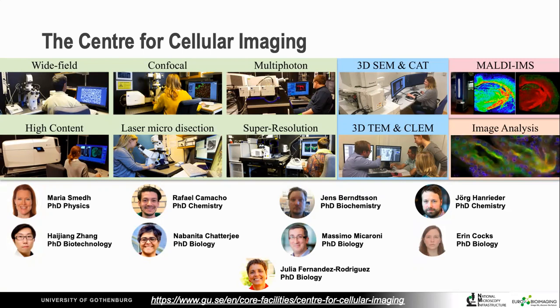And then depending on how we prepare the sample, in some cases we actually manage to do what we call correlative workflows, where we take exactly the same piece of tissue or cells or sample and move it through the microscopes. So you might get images that have different resolution scales, different contrasting agents, and different methods to create contrast. Then, of course, there is a thing that joins them all together, which is the one at the bottom right, which is the image analysis. And that's a little bit what we're going to be talking about today, right?